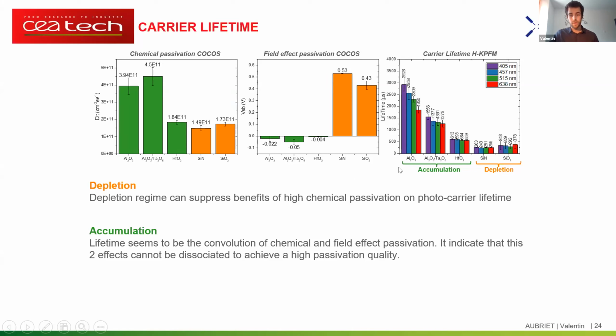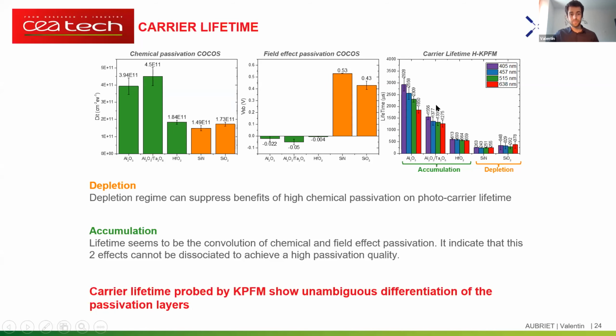But the most important information is that if we look at the COCOS measurement, only the density of defects or the field effect passivation, we cannot differentiate these two layers. But when we look at the carrier lifetime probed by KPFM, we can clearly differentiate all the passivation layers. So this makes the carrier lifetime method a good method for studying embedded interfaces and a highly sensitive method.